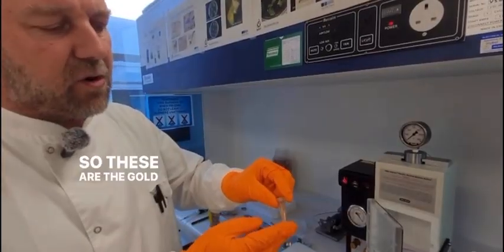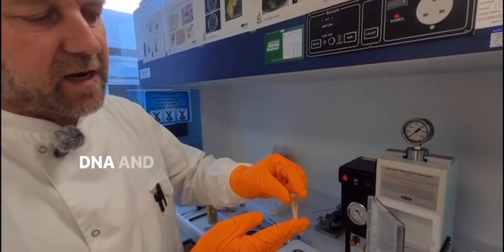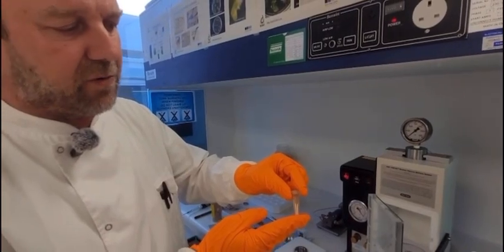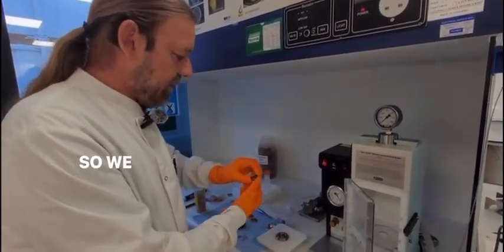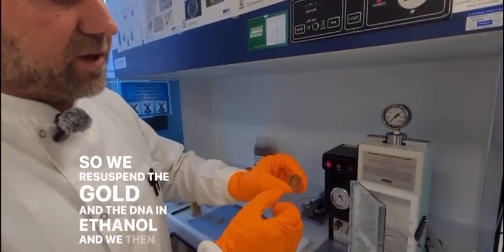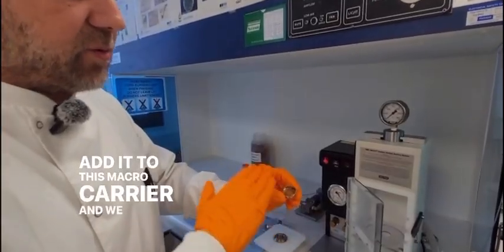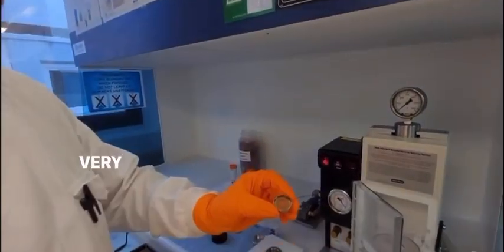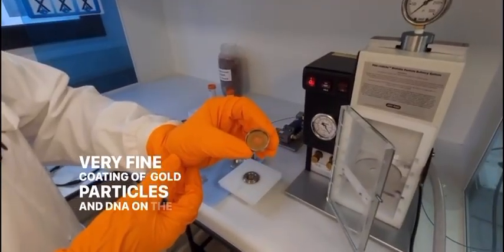So these are the gold particles and we will coat those with DNA and then shoot them into the plant material. We resuspend the gold and the DNA in ethanol and we then add it to this macro carrier and we have a very thin and very fine coating of gold particles and DNA on the macro carrier.